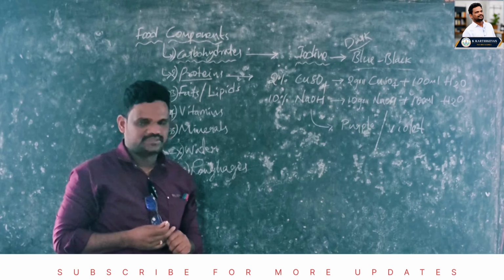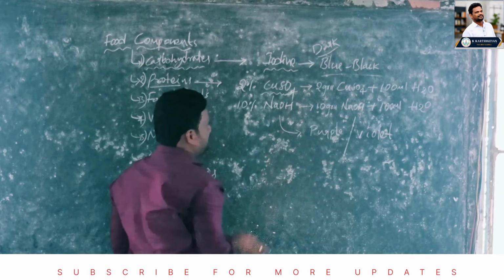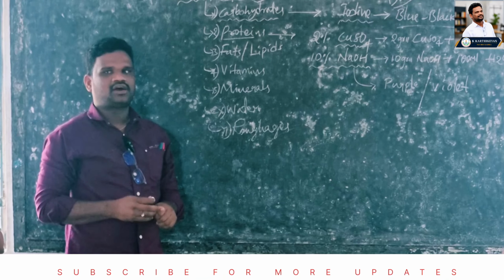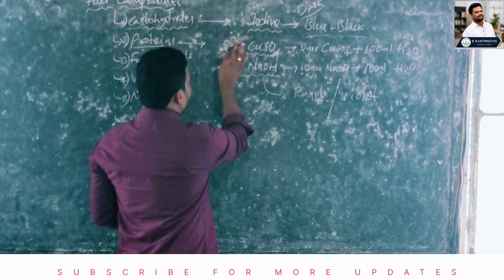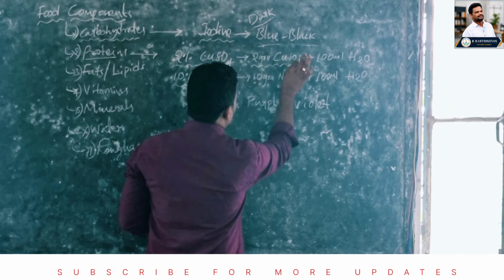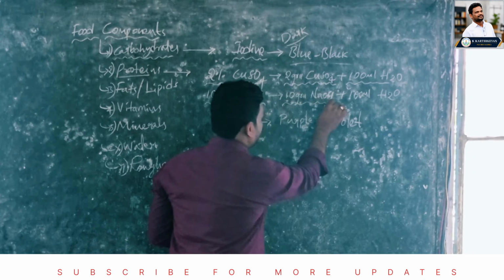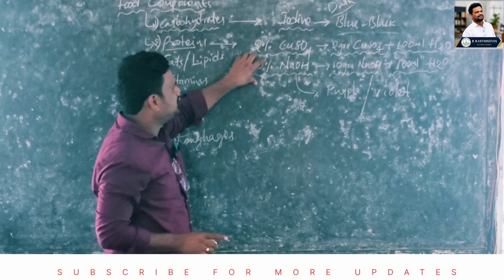Proteins, to test the proteins, we need 2 chemicals. 2% of copper sulfate, CuSO4. Second, we need 10% of NaOH. NaOH means sodium hydroxide. How much percentage of sodium hydroxide is needed? 10%. To make 2% of CuSO4, we have to add 2 grams of copper sulfate in 100 ml of water. To make 10% NaOH, we need to add 10 grams of NaOH in 100 ml of water. Then only we can prepare 2% copper sulfate and 10% NaOH.